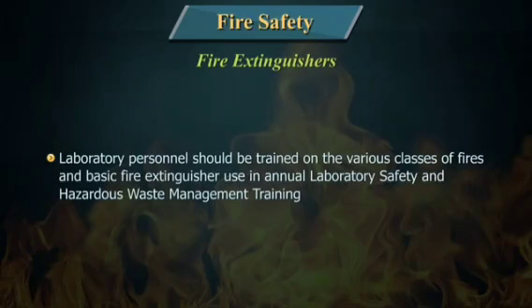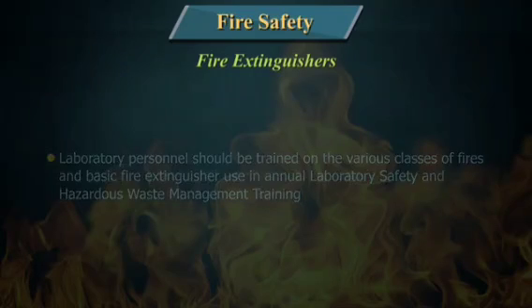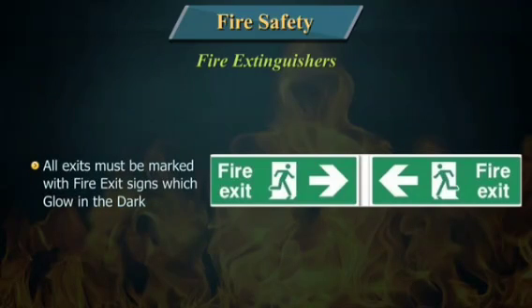Laboratory personnel should be trained on the various classes of fires and basic fire extinguisher use in annual laboratory safety and hazardous waste management training. All exits must be marked with fire exit signs which glow in the dark.